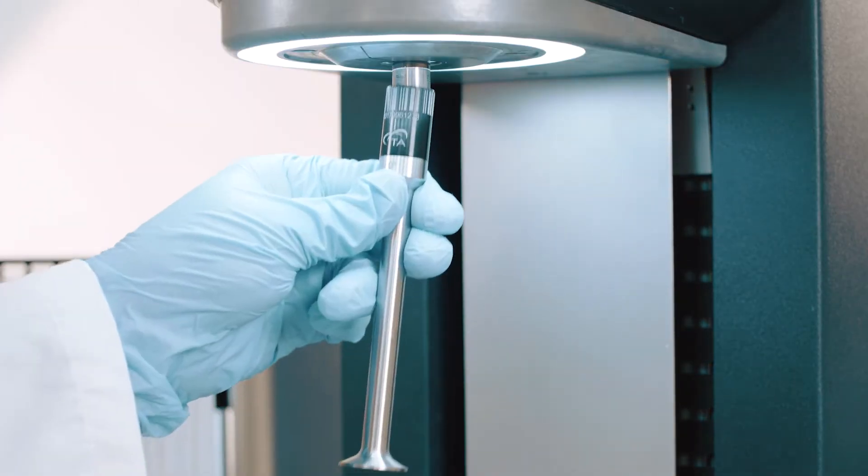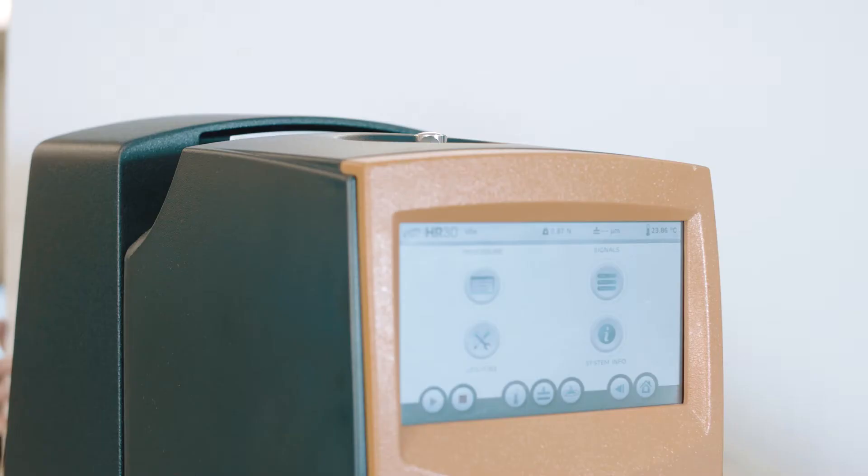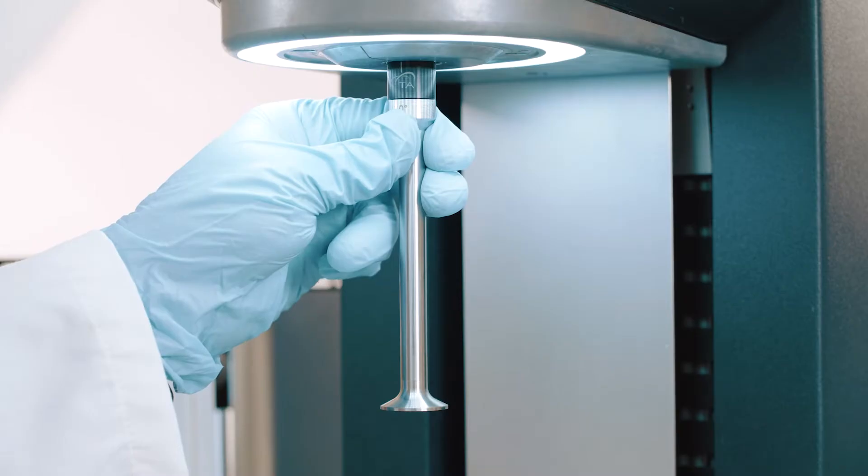With the rheometer head raised, load the 25 millimeter geometry by pushing it up the spindle and screwing the jaw rod finger tight.